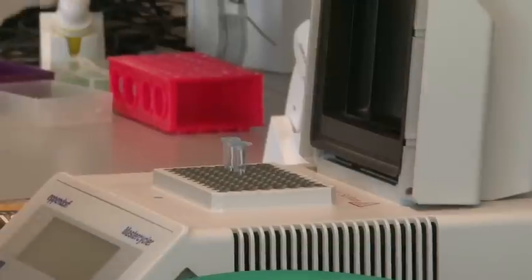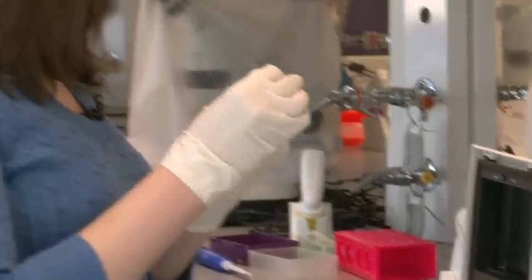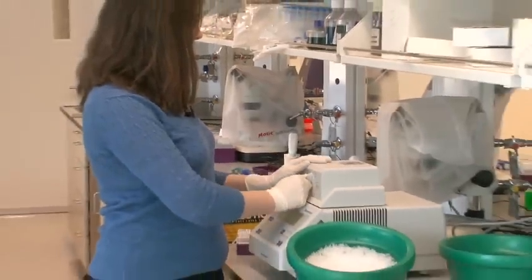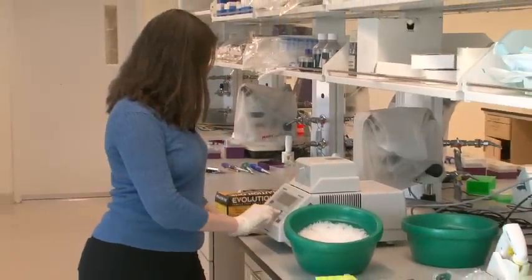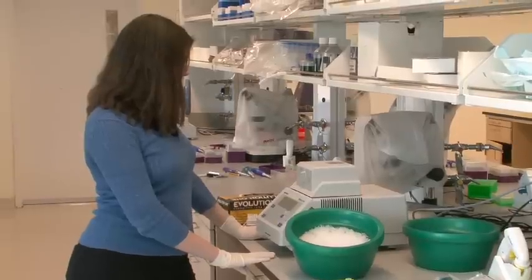So when I've put all 4 of my tubes into the machine, I just close the lid, lock it down, and then I hit start, and the program's going to start running.